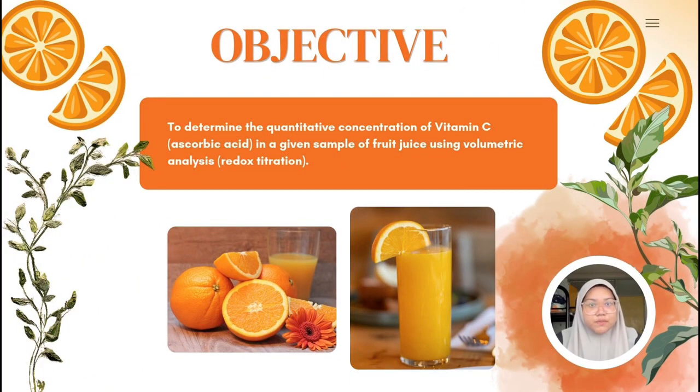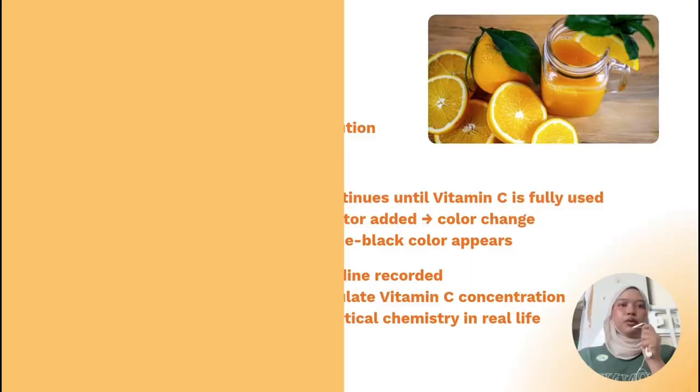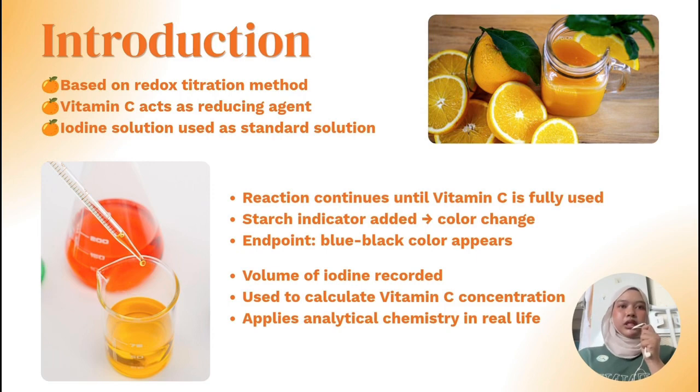The objective of this experiment is to determine the quantitative concentration of vitamin C, which is ascorbic acid, in a given sample of fruit juice using volumetric analysis. Now, I will briefly explain the introduction of this experiment.